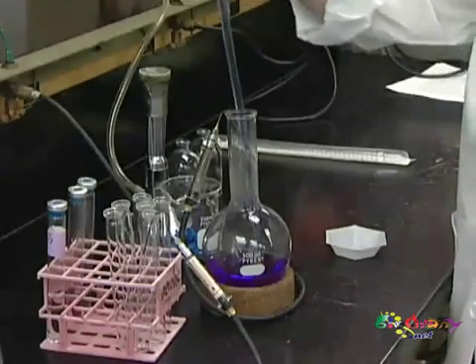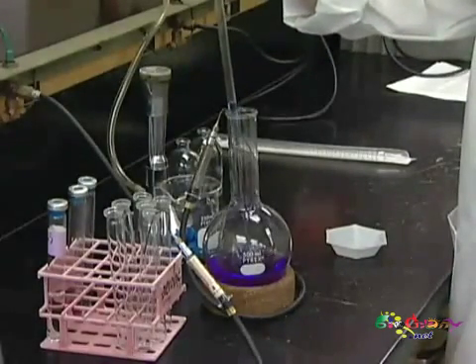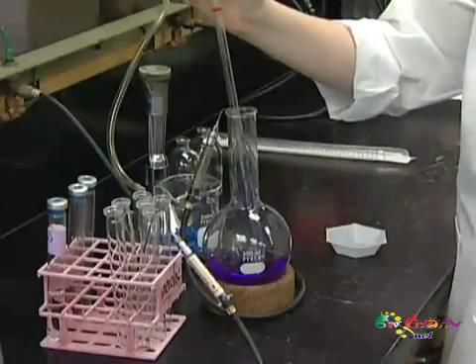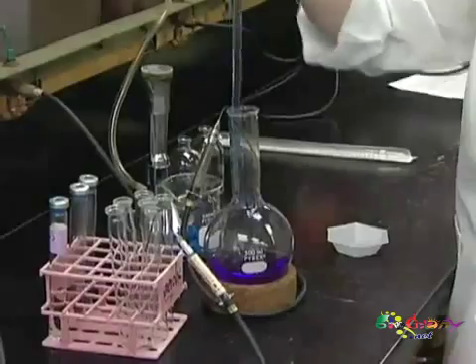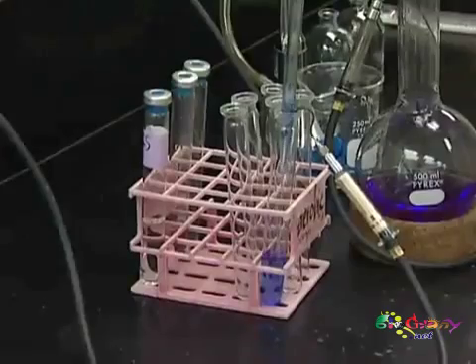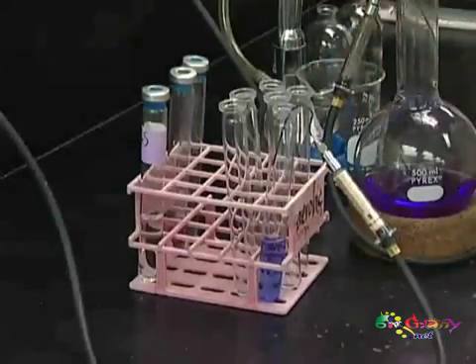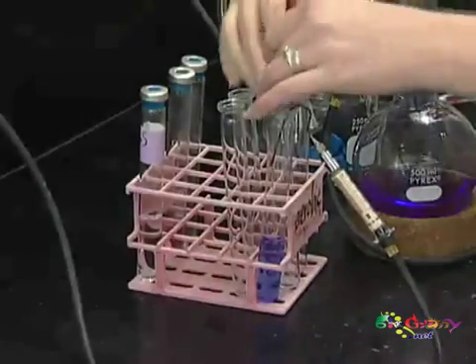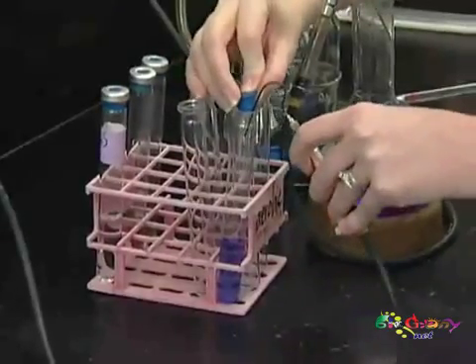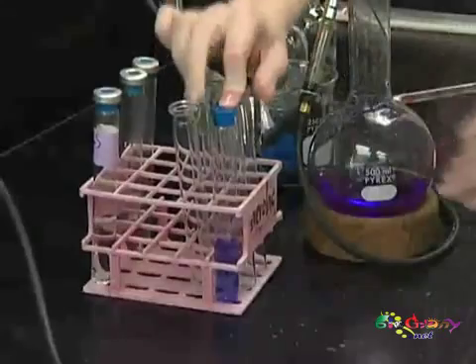If you need to rinse down the sides, this would be a good time to do it. And now we'll dispense into the tube. When you go to stopper, you want to make sure that you don't pull out the probe before you get the stopper in place. So you'll carefully pull out the probe while pushing in the stopper.